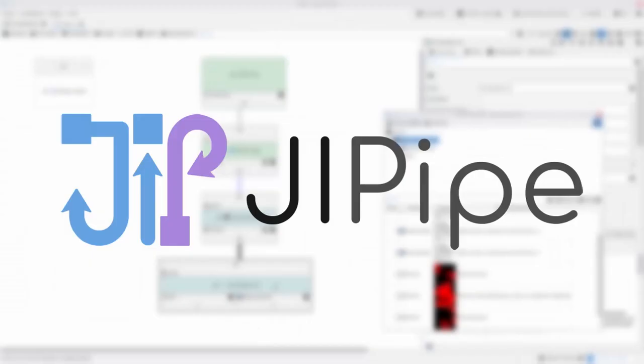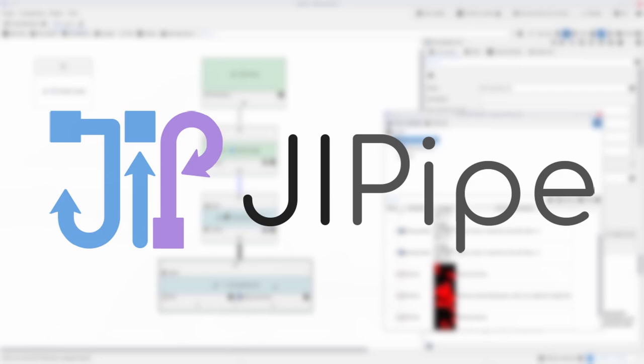With such a visual language, we truly would have macro programming for everyone. And Jipype brings exactly this feature into ImageJ.